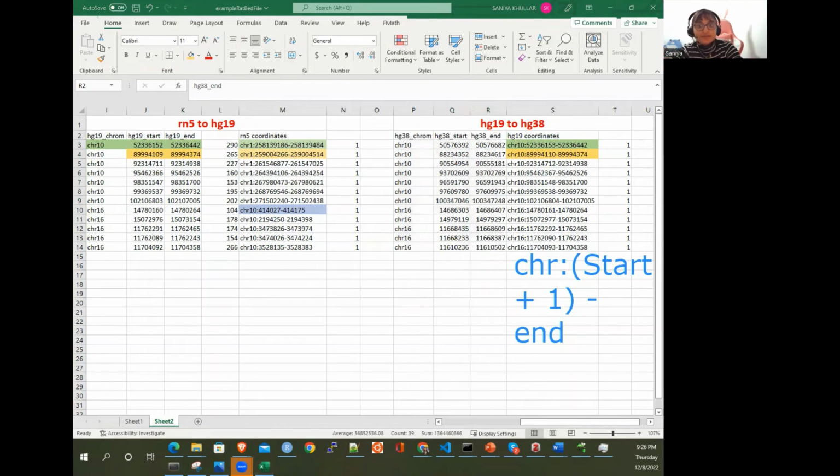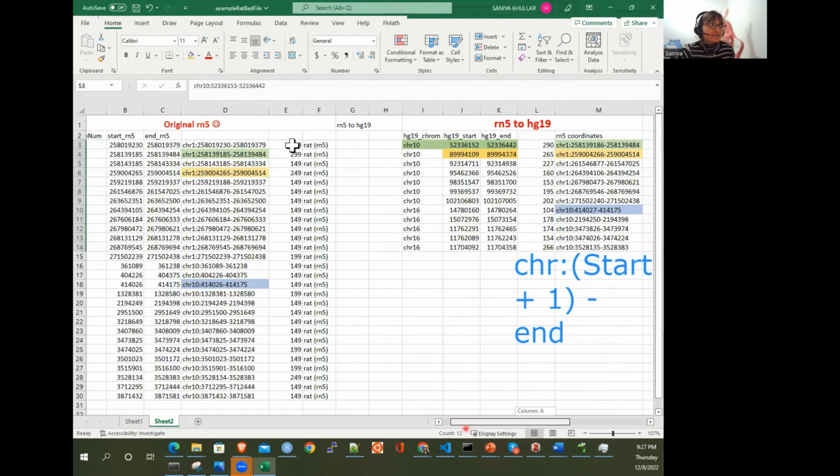So then you can trace it back a bit and see that, similarly, I think it's going to be the case where these tend to line up. All of these regions tend to be the same over here. I think it just maps perfectly. There's no jumbling around. Whereas over here for the rat, it's not exactly like that.